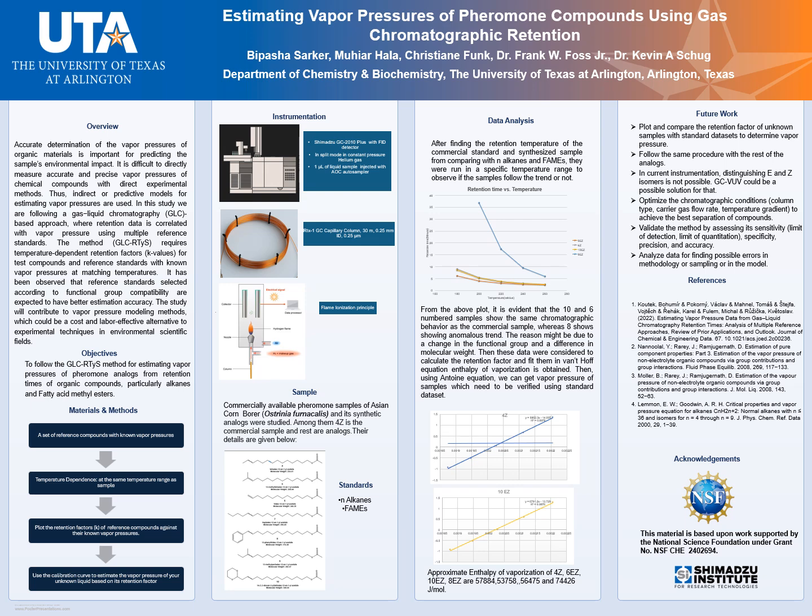If we rely on only one type of standard, sometimes due to differences between the standard's functional group and the sample's functional group, we might get different results. So, for example, our samples are esters.